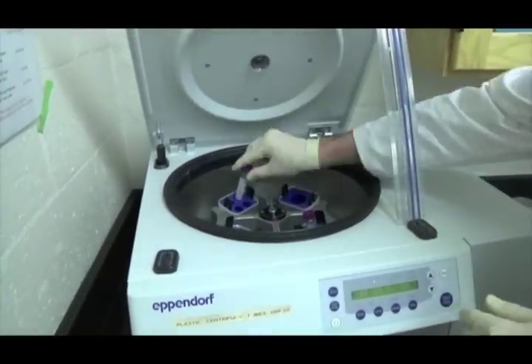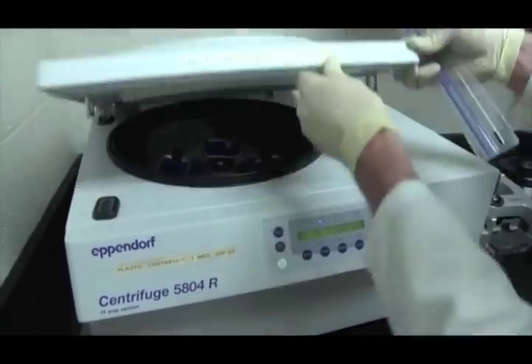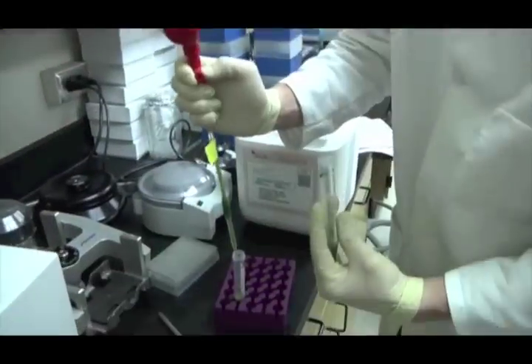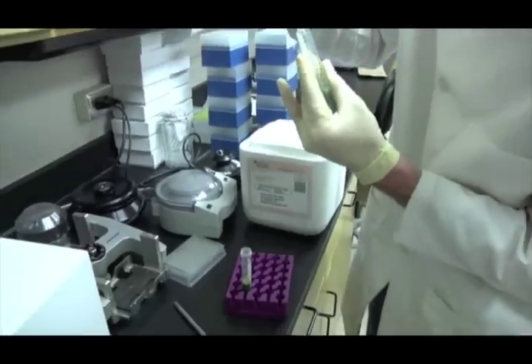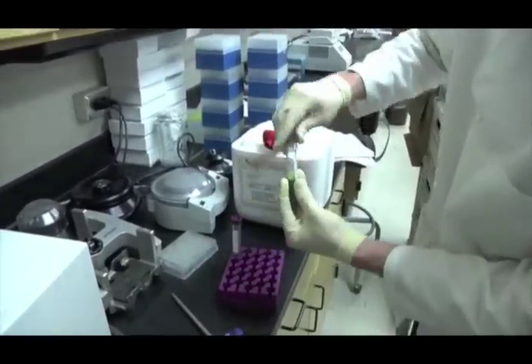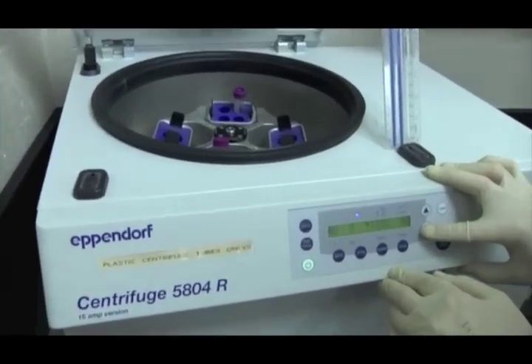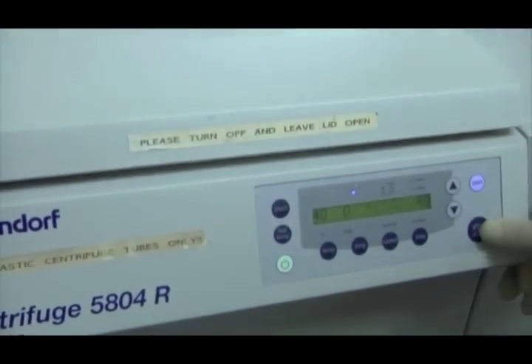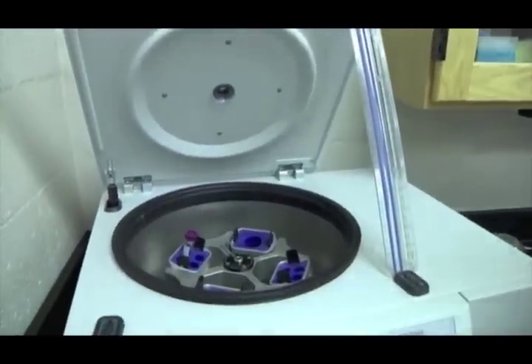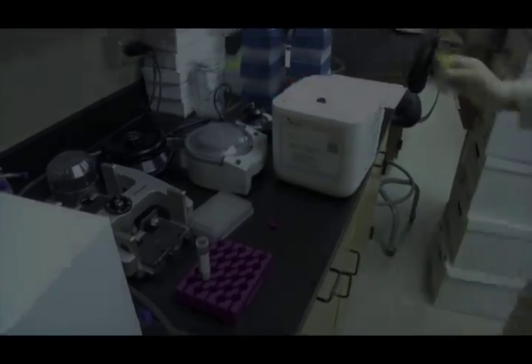Filtrate is then centrifuged at 200 G for 1 minute to remove any remaining plant debris. Resulting supernatant is decanted into a clean chilled centrifuge tube. The chloroplast fraction is then isolated by centrifuging at 1300 G for 5 minutes. Remaining supernatant is discarded and the chloroplast fraction is returned to the ice bath.